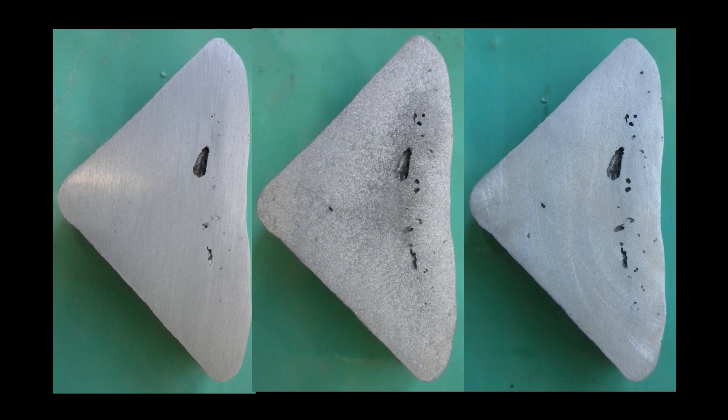Finally the sample that's been slightly polished after etching and now the porosity is really visible and you can see it very clearly.